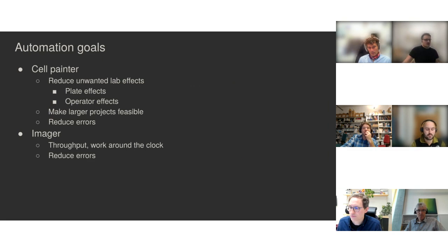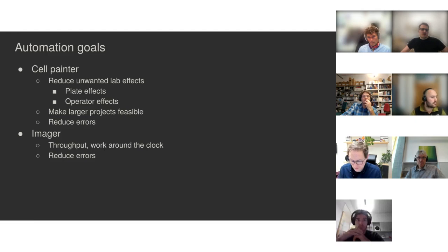But here we know that we can run the same thing tomorrow as we did 1 year ago. And it also makes larger projects feasible, that we can do these templates without our users becoming mad. We have a big screen coming up tomorrow. It will be one of the largest we've done on one single day. It'll be about 40 plates. And I don't think anyone employed here would want to do that manually.